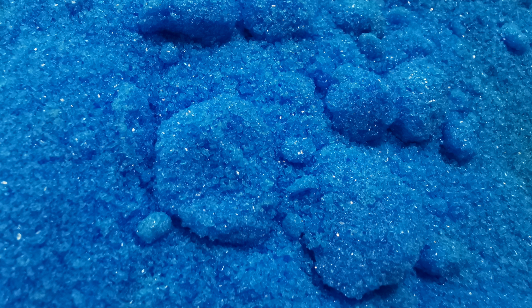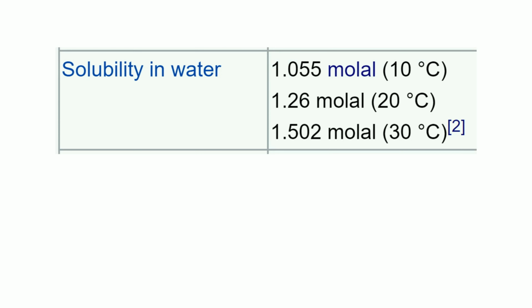How much do we need to dissolve? Well, we need to know the solubility, i.e. how much can dissolve at whatever temperature per whatever volume we have. So I want the solubility of copper 2 sulfate in water. I do a quick Google search and I come up with something like this. Now, this is straight from Wikipedia.